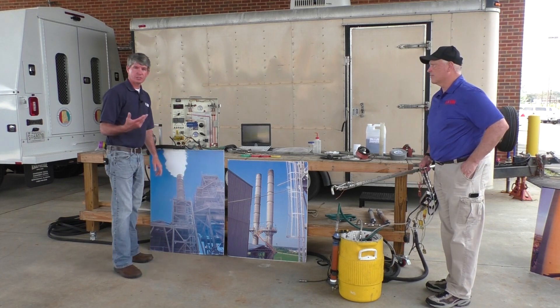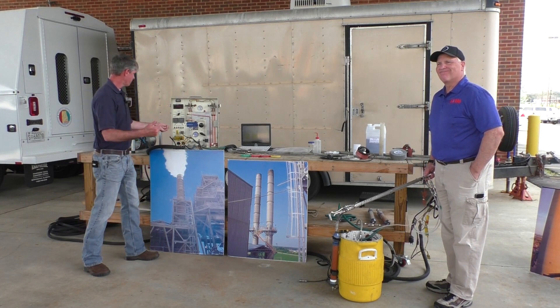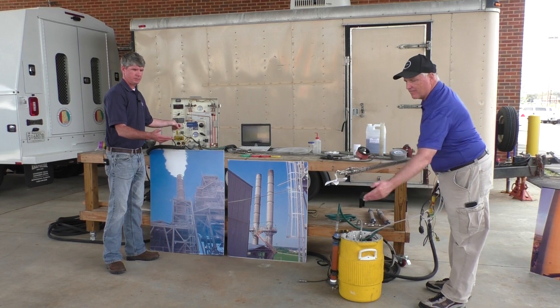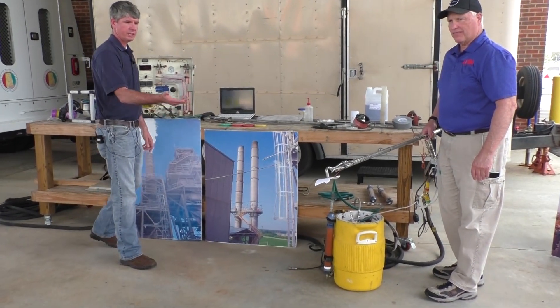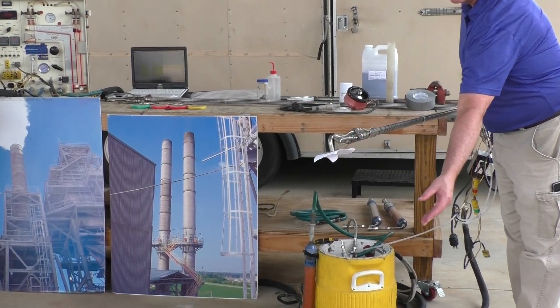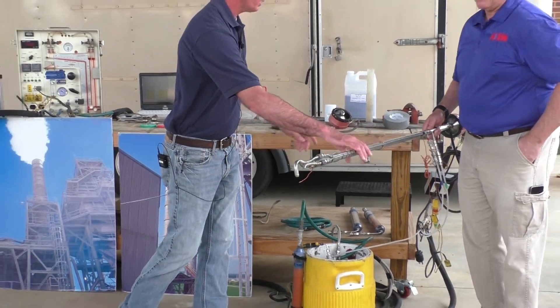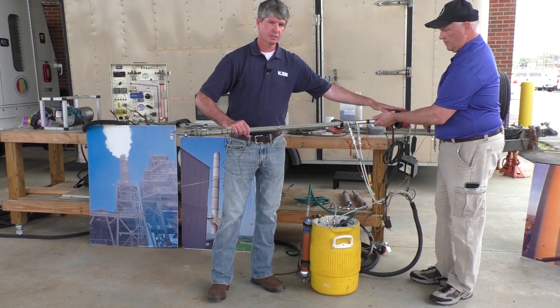So when we get ready to start the test, we place the probe in the stack, and then we turn our pump on. It is a vacuum pump, as I said earlier. And as you can see, it pulls the sample in. As the sample goes in and goes across our filter, the filter collects the particulate.